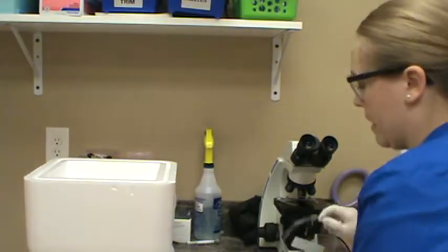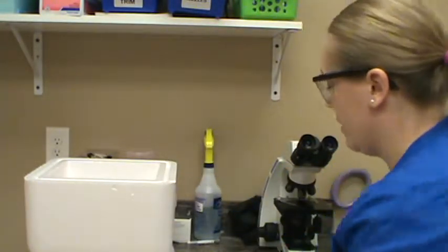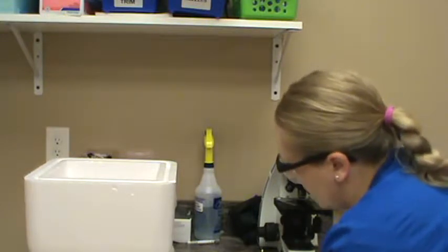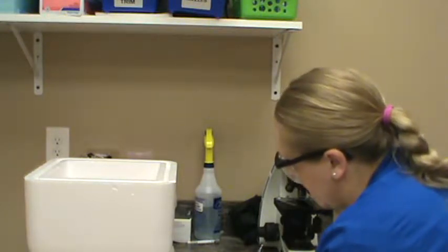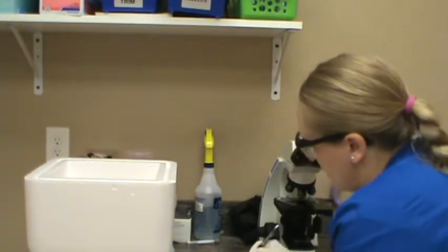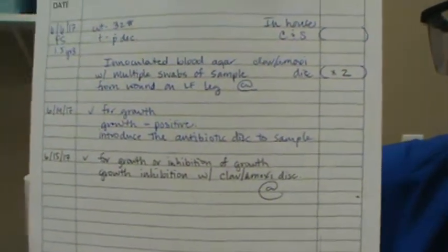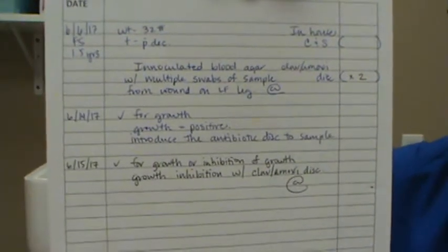So we're going to mark in the chart that preliminary results look like it is working. So mark here, growth inhibition with Clavamox disc. Okay, so we've recorded that in the chart here, growth inhibition with the Clavamox disc, and I'm going to let that go another 24 hours, just for my own curiosity, to see if it works even more on those little pieces of bacteria that we're growing. So that was VETT 222, task 18, and that is the finish of the culture and sensitivity.